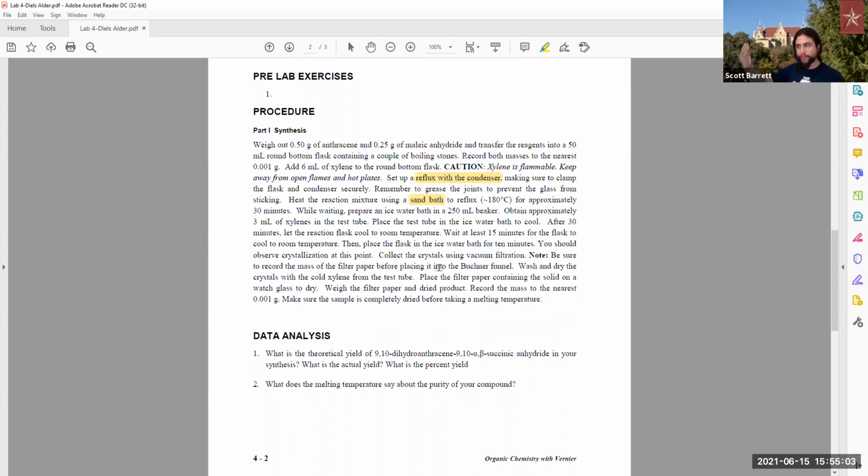But whenever we come down and lower the temperature, the solubility simultaneously lowers, and especially in a heterocyclic system with the ketones and your hydroxyl group on there, it's going to be a little bit more polar, meaning it's going to want to pull out of xylene because xylene is a very nonpolar solvent.